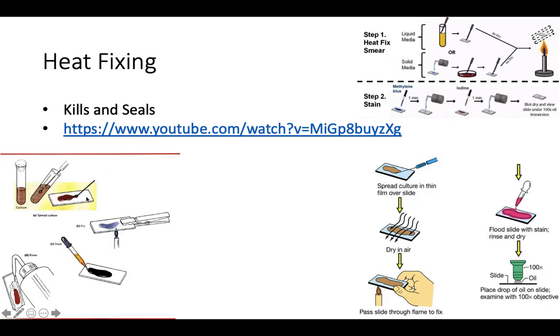As microbiologists, we don't want that. Living bacteria is not a fun thing to work with, especially underneath a microscope. You don't want to get living bacteria on the microscope to cross-contaminate it. You also don't want to have the risk of dropping the slide and getting bacteria on the table or maybe on yourself or something like that.